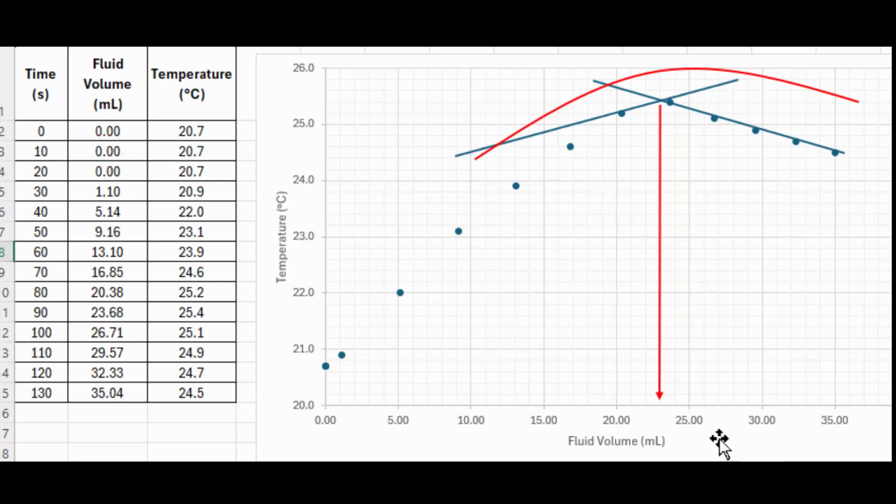You've got to remember the previous method got to about 1% error or less than 1% error, and that's just doing it very roughly the first time, like this one here. And so you can see that there's a huge systematic error here in not letting it reach its highest temperature, and that could perhaps get us to the correct number, which is 25. So I have to throw this one in here.